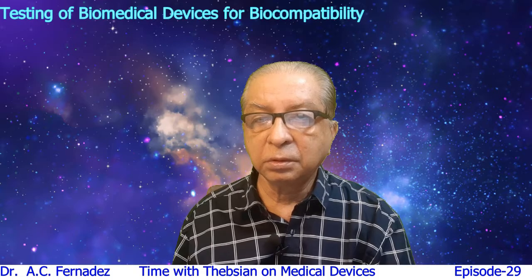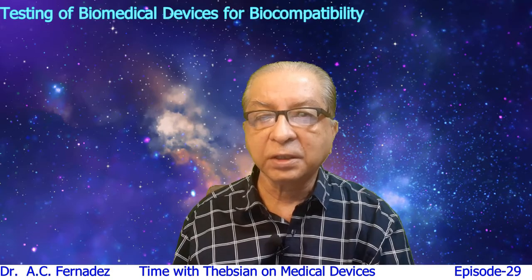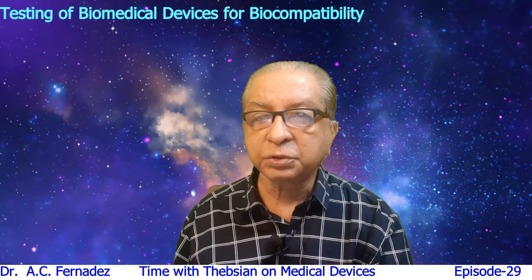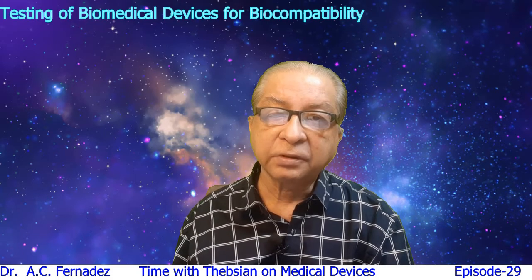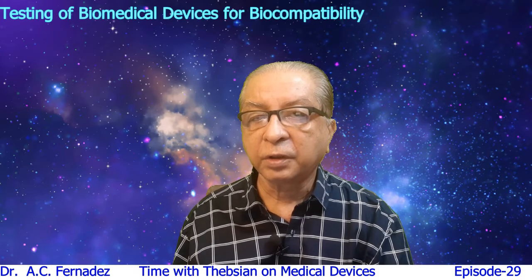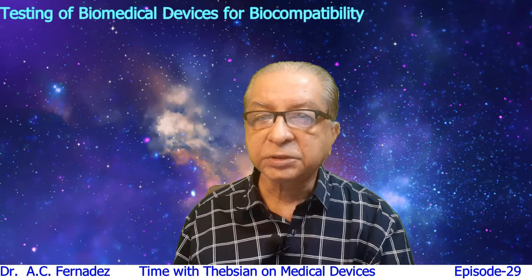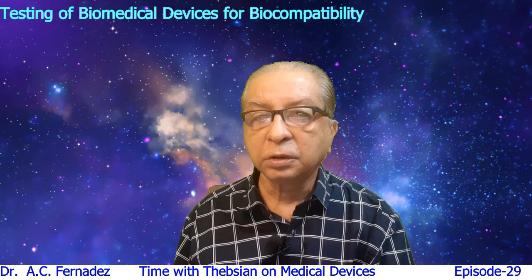So it goes without saying that here the toxicologist decides what type of cell he will use and what type of estimation techniques he will use to analyze the cause of death or cause of growth of the cell culture in using cell culture technique for testing biocompatibility of test materials in vitro.